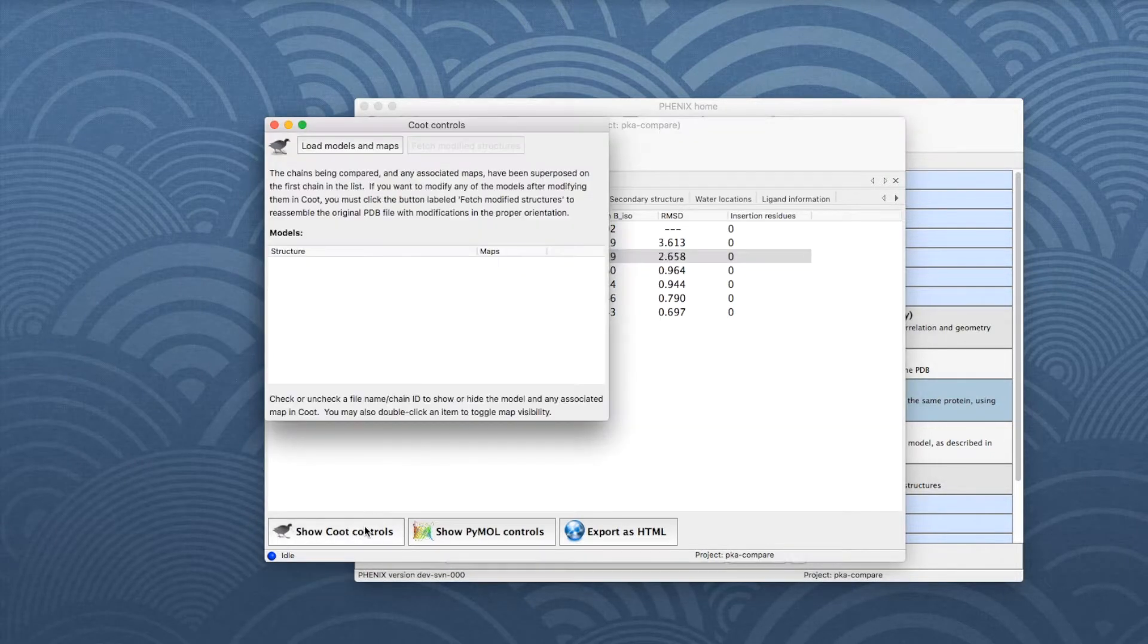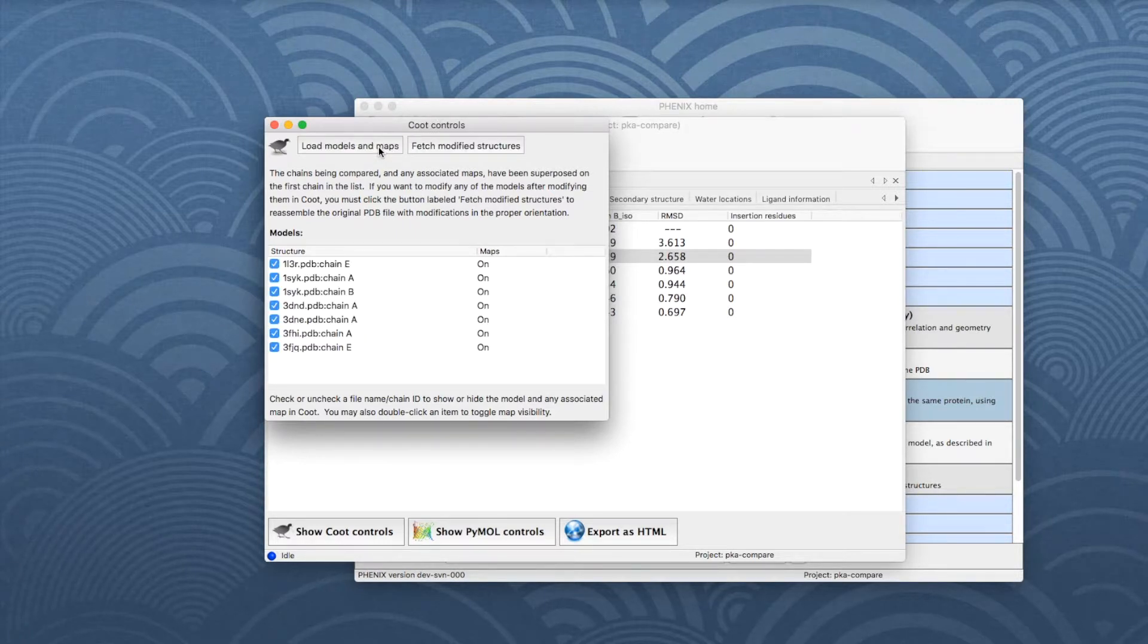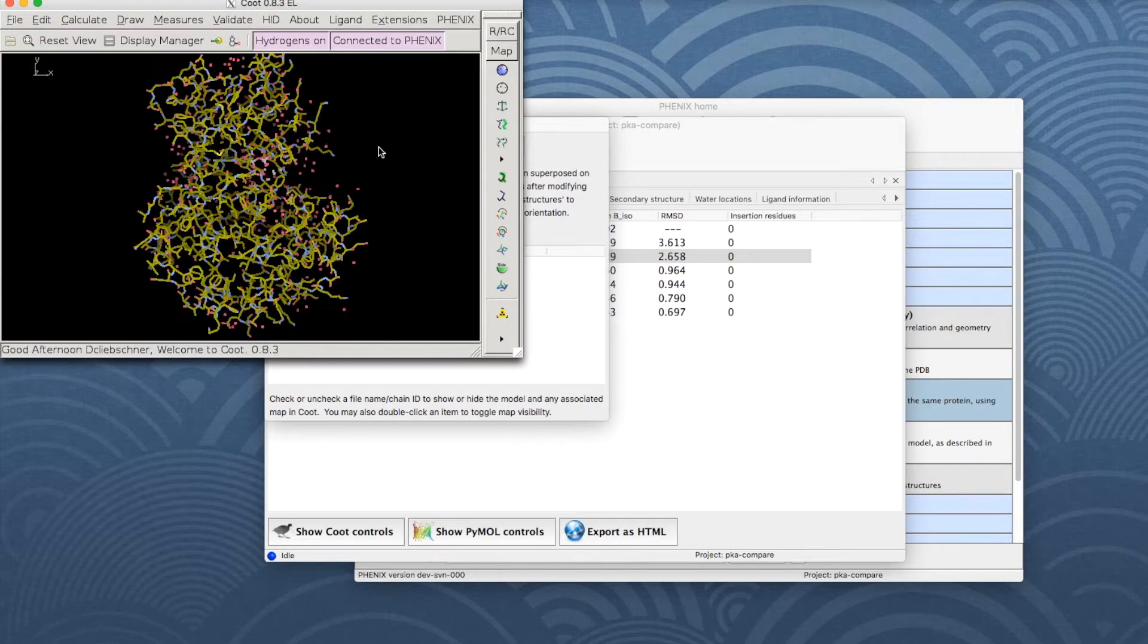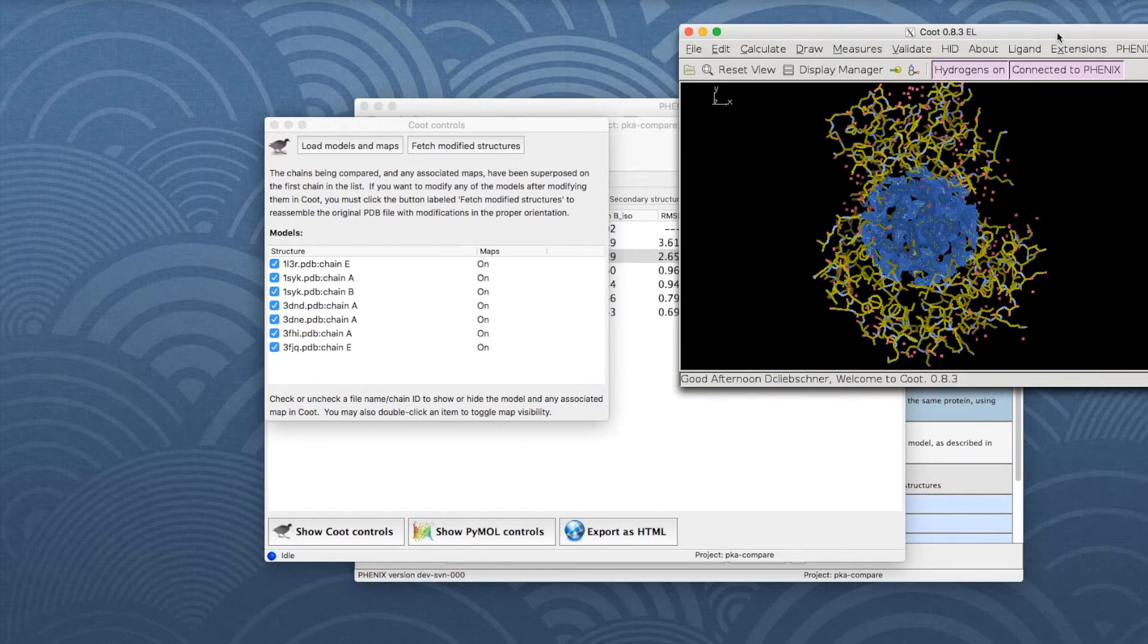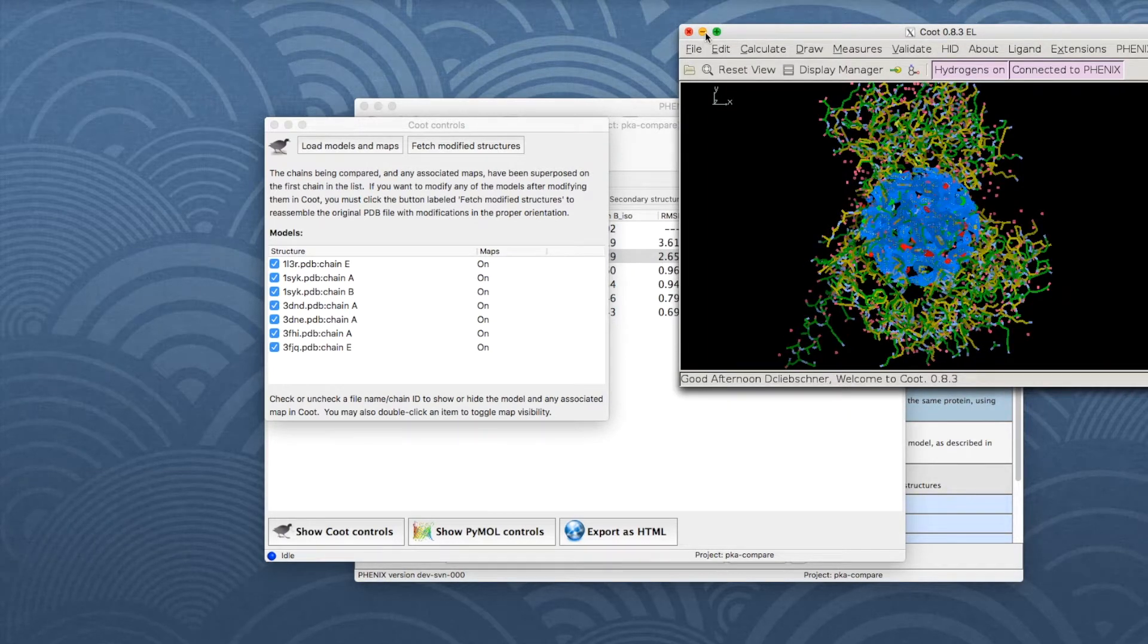Click on the Show COOT Controls button. In the COOT Control window, click Load Models and Maps to open a COOT session with the superposed models and maps. We will look more closely at the structures in a moment, but let's first continue with the result tabs.